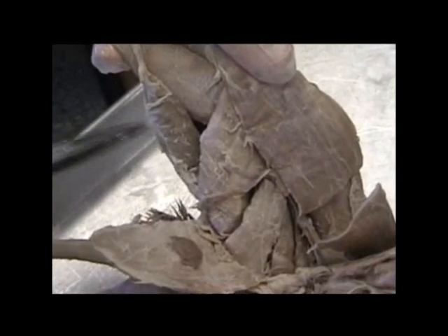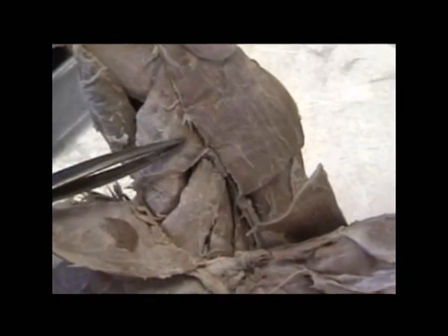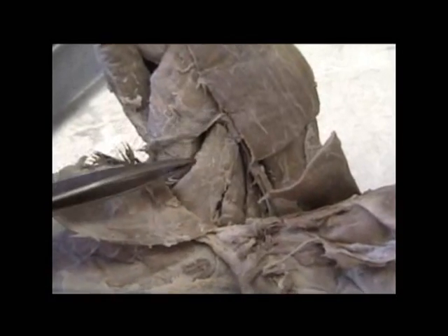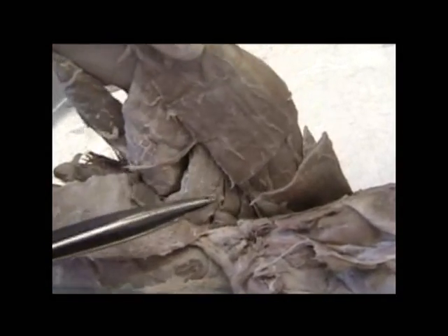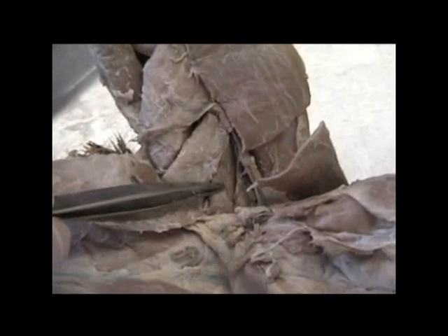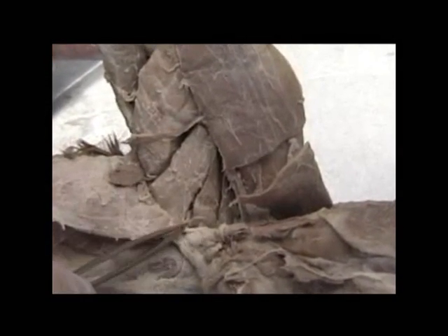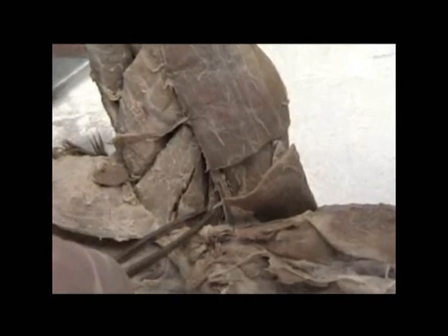That's the most posterior, the semitendinosus, the semimembranosus, made of two pretty large masses, and then the adductor group that pulls the leg towards the midline, and we have the adductor femoris and the adductor longus. Making a correction here, taking a second look, this is the adductor group, but this is two masses which make up the adductor femoris group, and then this is the adductor longus. So adductor femoris and adductor longus.